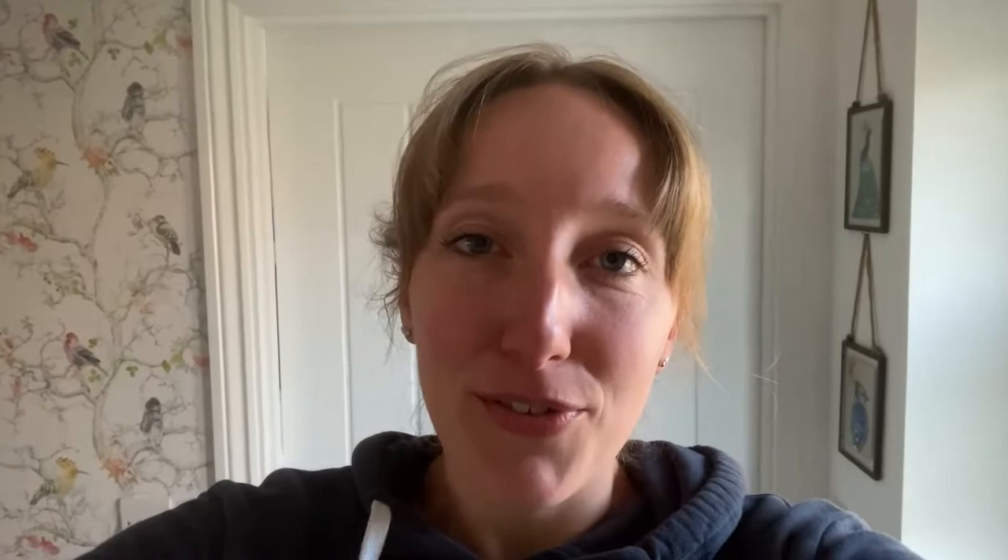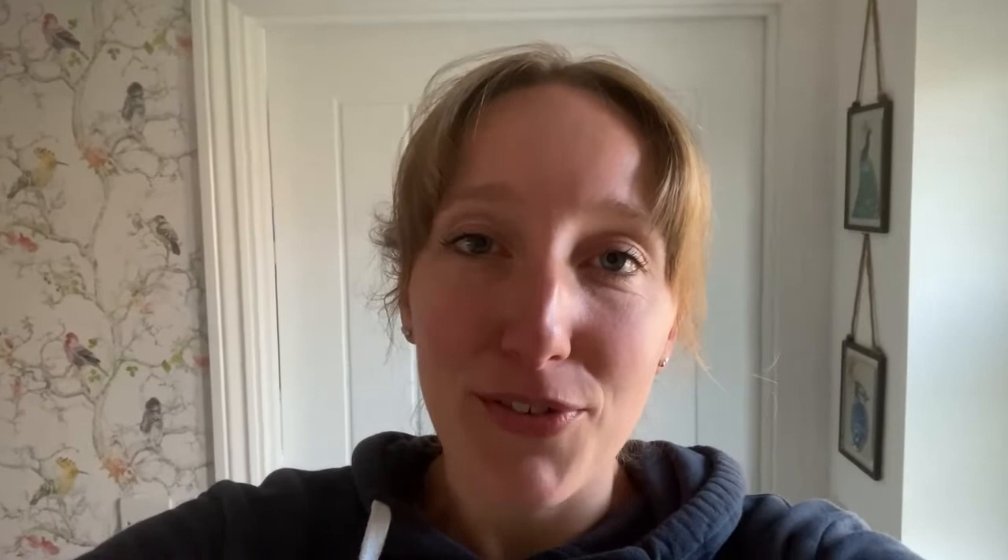I noticed over the weekend, as I was walking past our neighbour's house, that he's got some pretty cool mushrooms in his front garden. So since I'm already going to be extracting DNA from the dried mushroom that arrived in the post this morning, I'm going to add a few more to the collection.